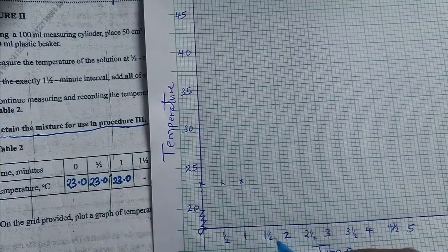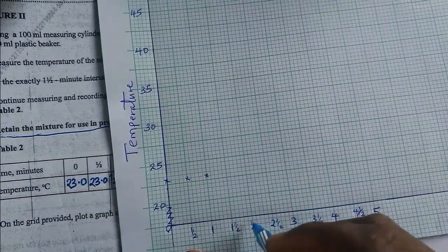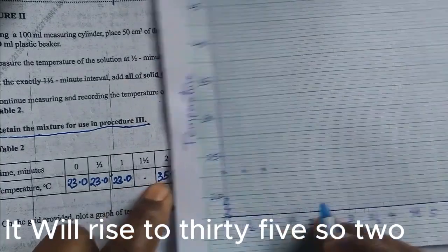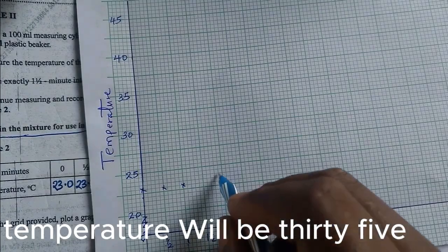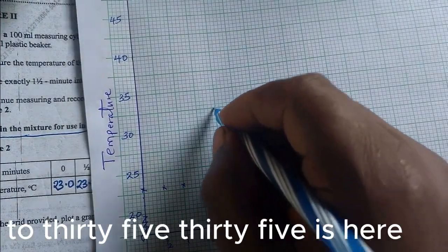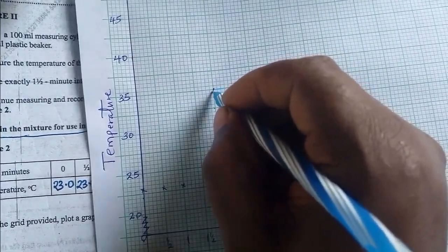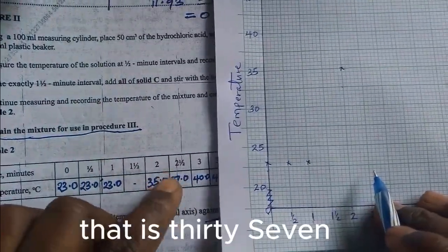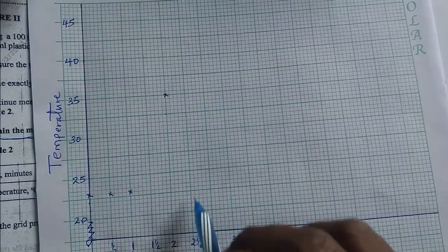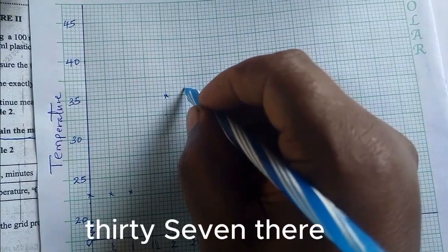At this point, we will put our solid and the temperature will start to rise. At 2, it will rise to 35. So you come to 35, 35 is here. You put your mark there. When the time is 2.5, that is 37. 2.5, 37 is 35, 36, 37 there.